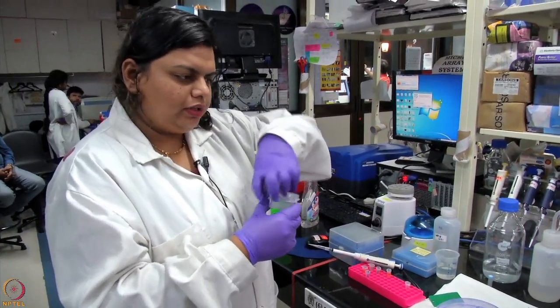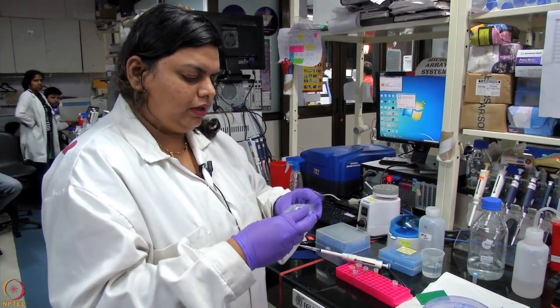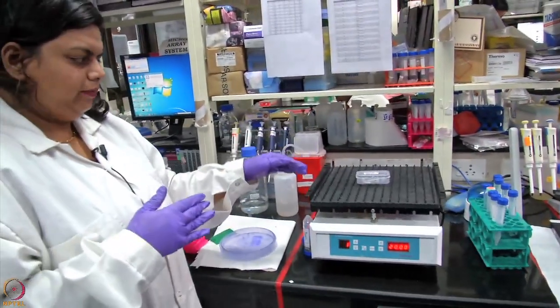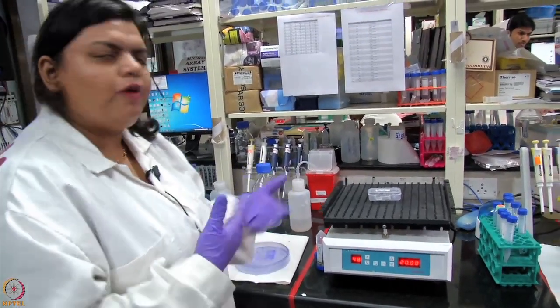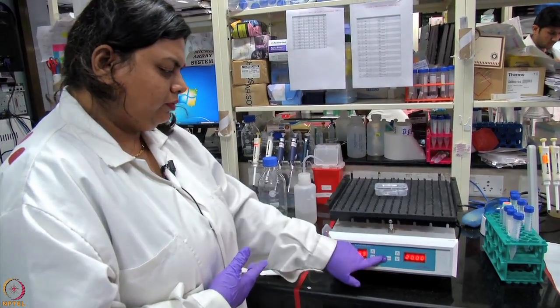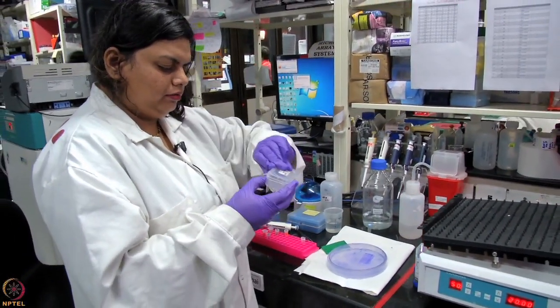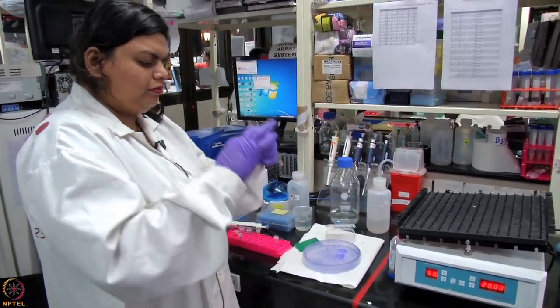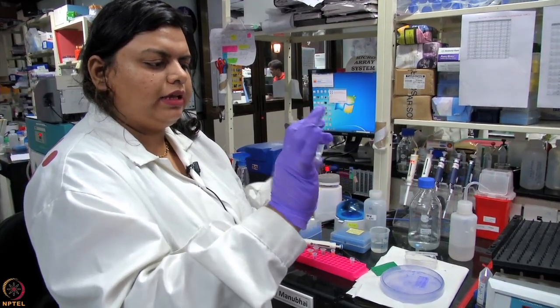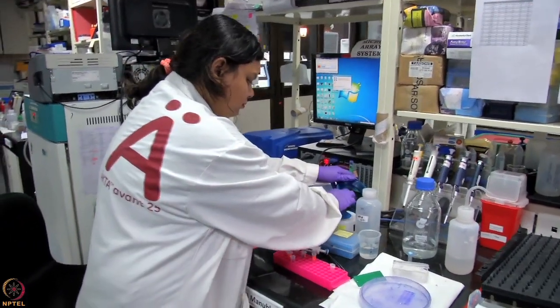followed by which we can put the antibody. So we'll just place it in a container and we will gently rock it for some time so that the buffer is uniformly distributed between the beads. Once it is mixed properly, you can again do a gentle tap and do an inversion so that there are no beads that are not in touch with the buffer, and then we can do a centrifugation.